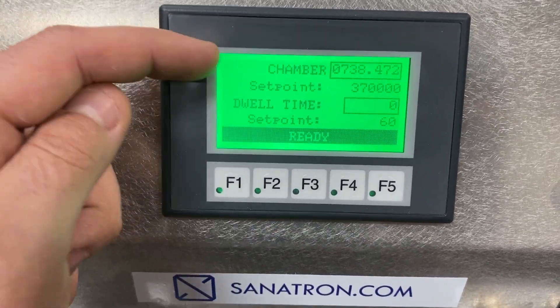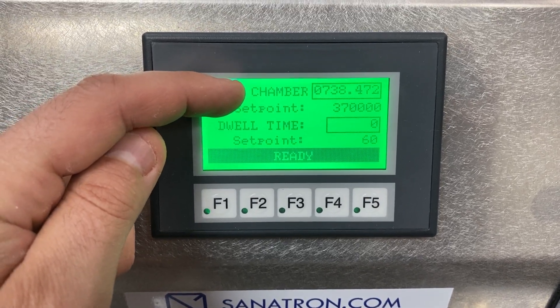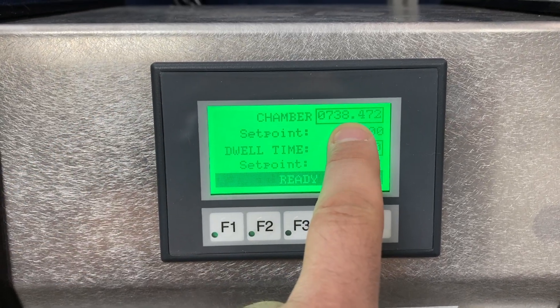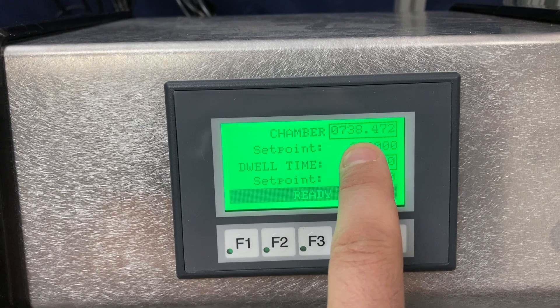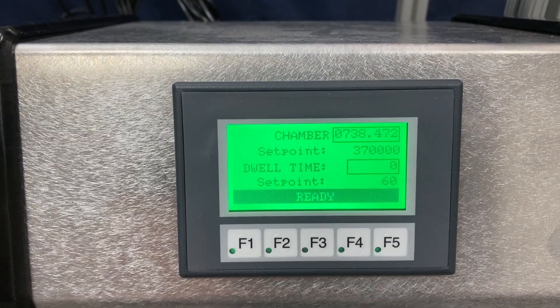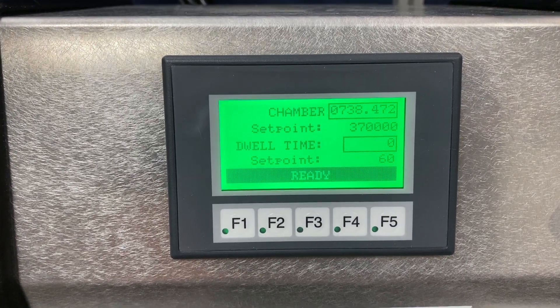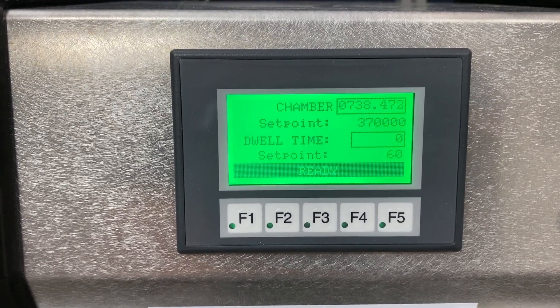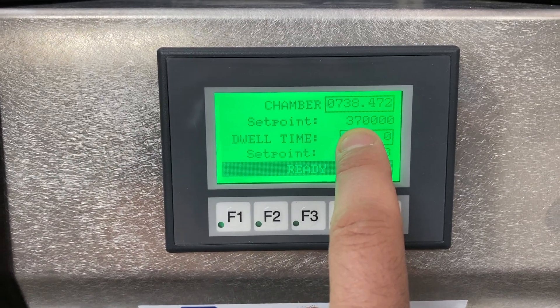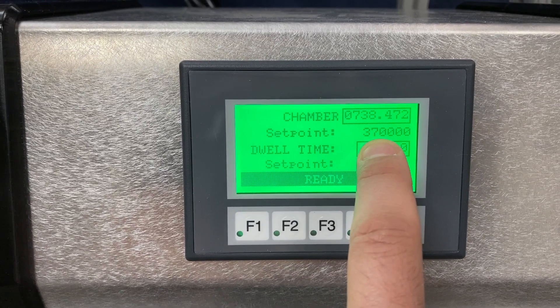The controller shows the current chamber pressure in absolute torr — it's about 738 torr. You'll notice it's a little lower than 760, which is absolute pressure at sea level, because we're at a slightly higher altitude here in Salt Lake City, Utah. The set point is about 370,000 millitorr, or 370 torr.